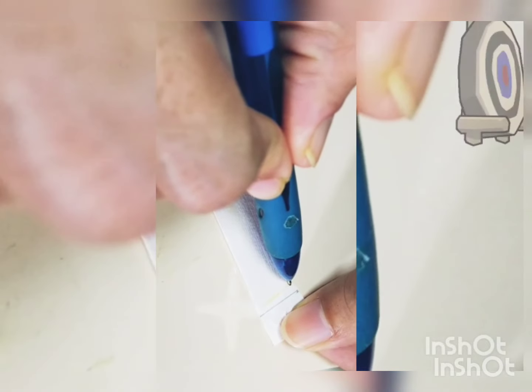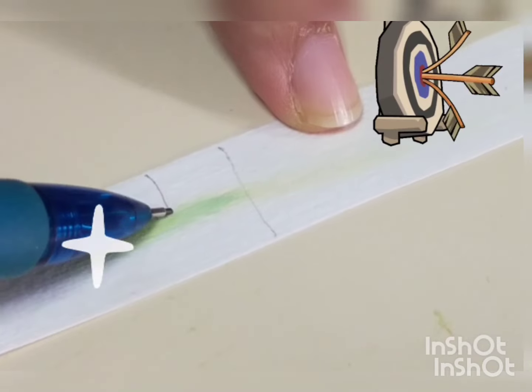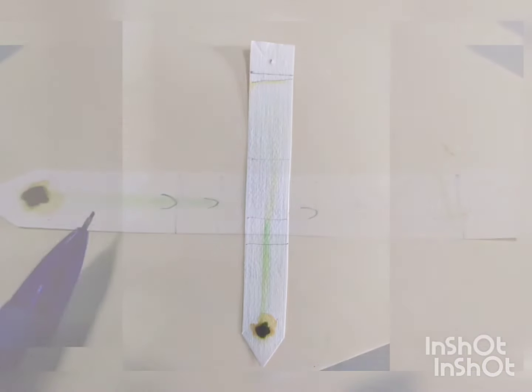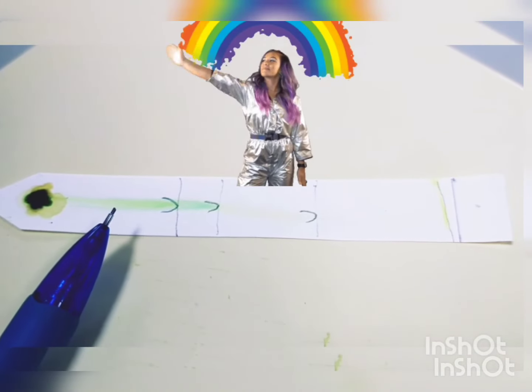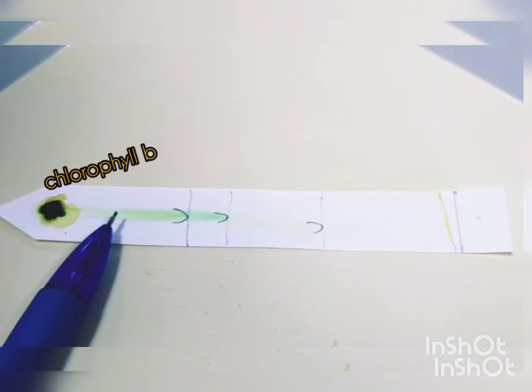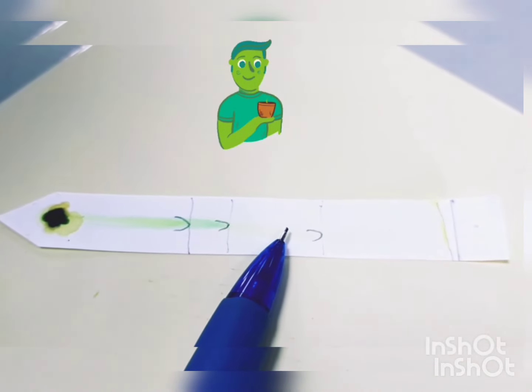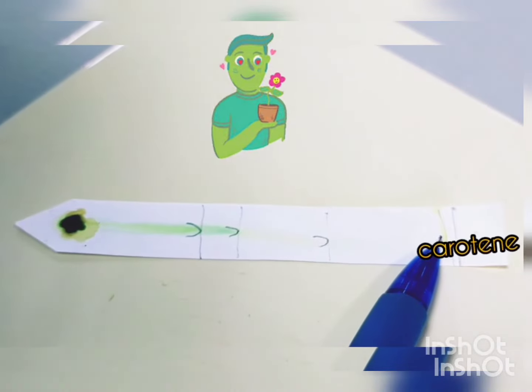Mark the solvent front with pencil. Mark the pigmented area. Each color on the chromatography paper is to represent different chlorophyll pigment. Yellow-green represent chlorophyll B. Blue-green, chlorophyll A. Yellow, xanthophyll. Gray, pheophytin. And orange for carotene.